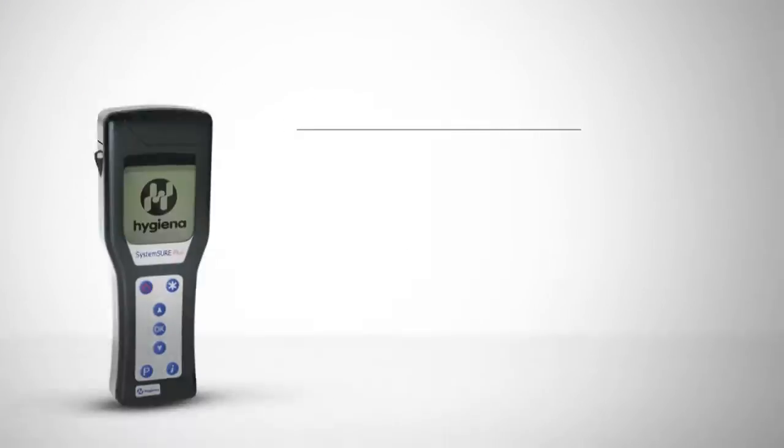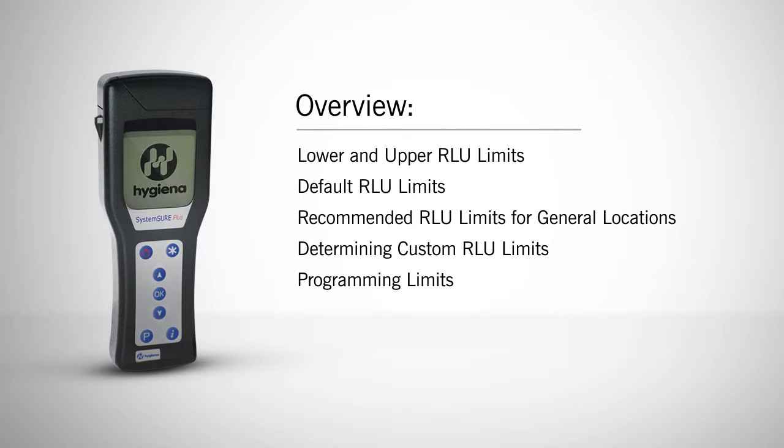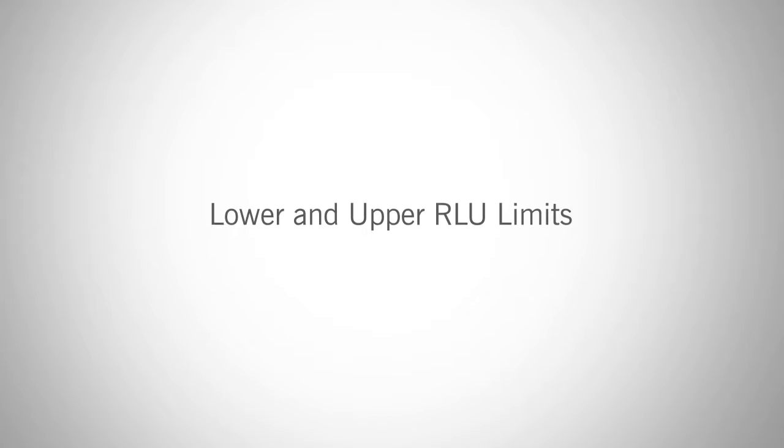In this video, we will cover lower and upper RLU limits, default limits on your system, recommended limits for general locations, how to determine custom limits, and how to program those limits. Let's get started. The first section is lower and upper RLU limits.